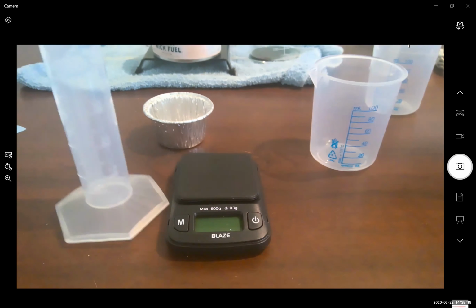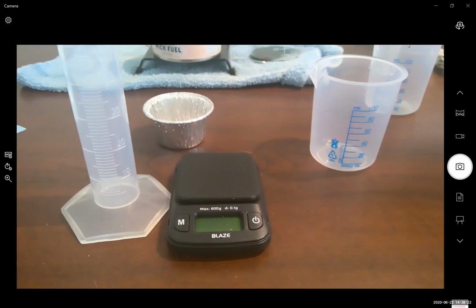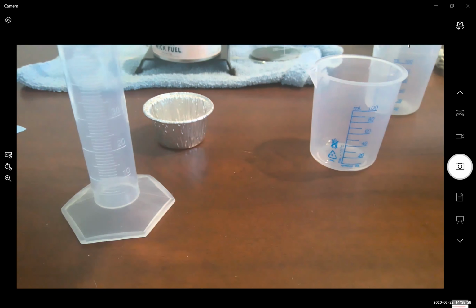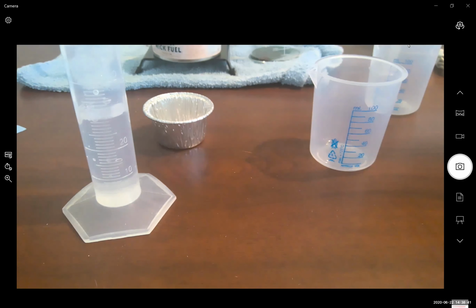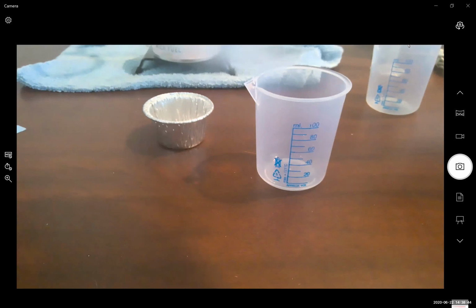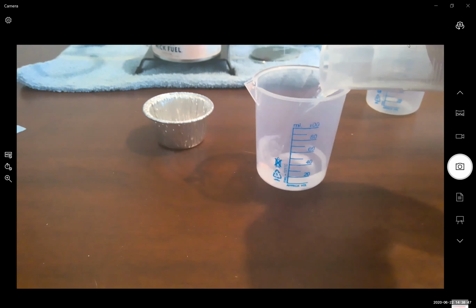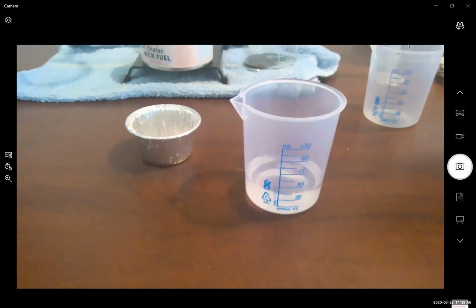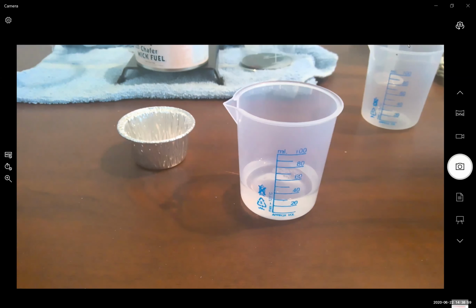While we're waiting for our sample to cool, we're going to pour 30 milliliters of deionized distilled water into our graduated cylinder. And then we're going to pour it into one of our beakers. That'll be our rinse beaker. Now we're going to wait a few minutes for our beaker to cool, and then we'll resume our processing.